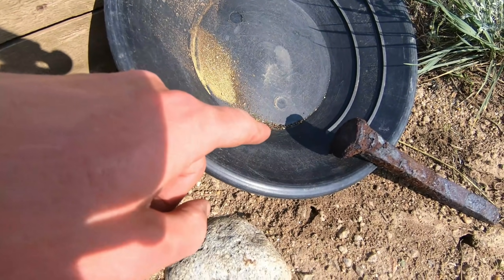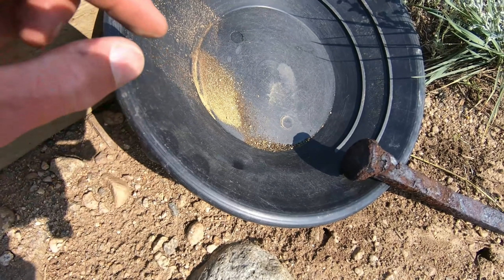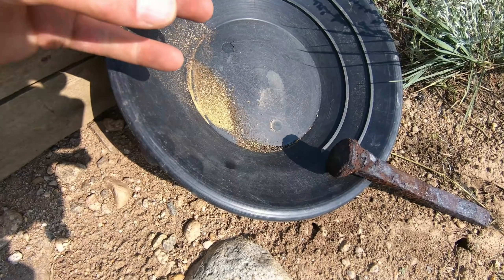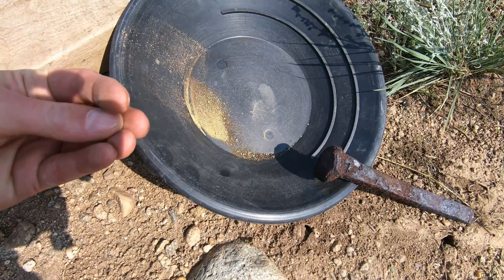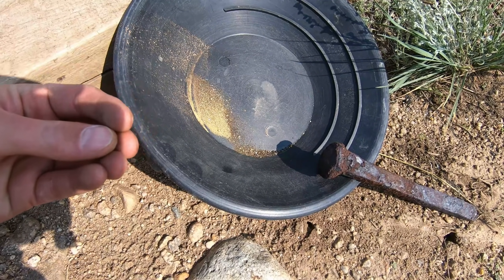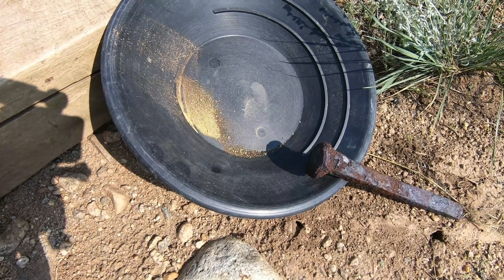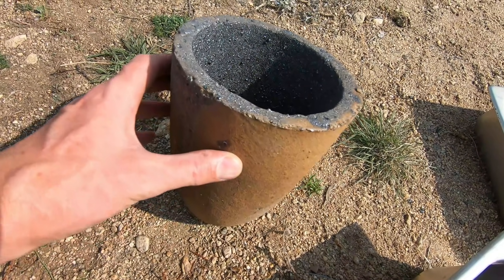We have a whole bunch of sulfides in here, some hematites, some pyrites, a little bit of gold, a little bit of copper. I tried to pull out all the copper BBs because when I cupel the lead button from smelting, the copper tends to draw a little bit of gold with it down into the cupel. So I picked out all the visible copper I could see. Now that we got our flux and ore all mixed up, we're gonna prep the crucible.